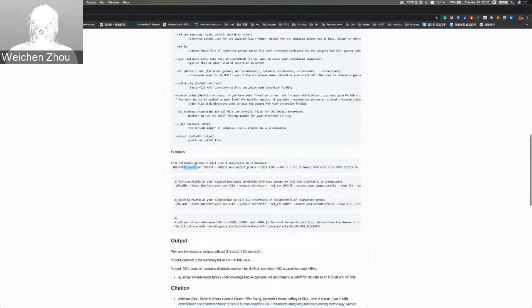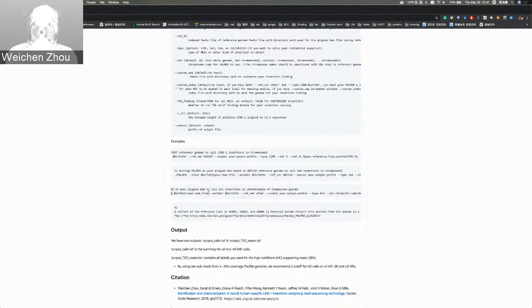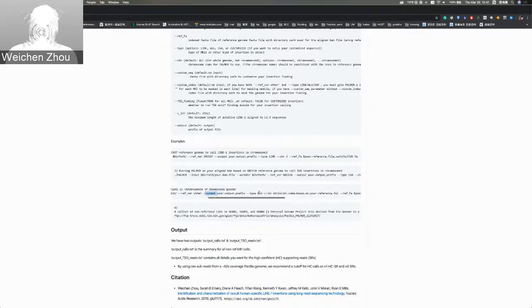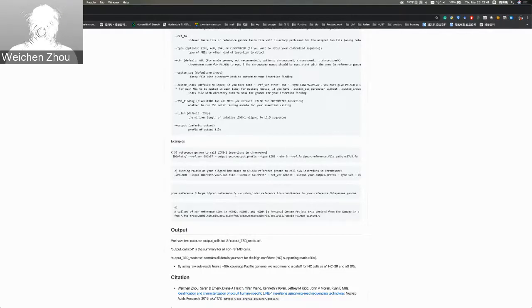For a third example, if you want to run Palmer on your aligned BAM to call ALU insertions in chromosome 2A of the chimpanzee genome, here is the example. You need input for your BAM file and working directory, reference version is 'other', output is your output prefix, type is ALU, chromosome will be chromosome 2A, reference FASTA will be the FASTA file for the chimpanzee reference, and you also input the customized index option including all reference ALU coordinates in your chimpanzee reference genome.